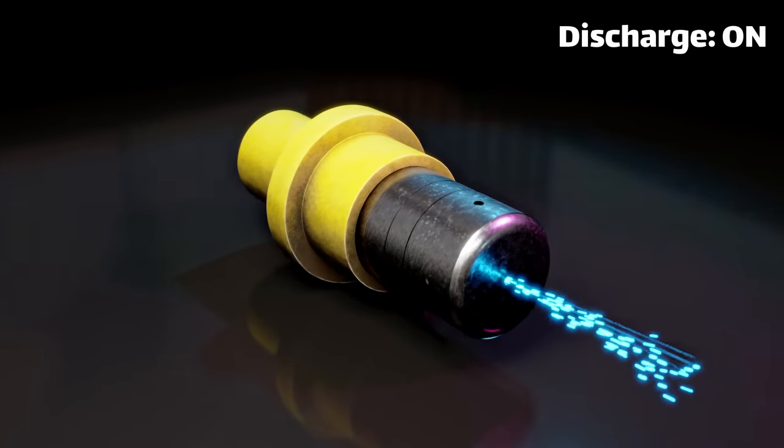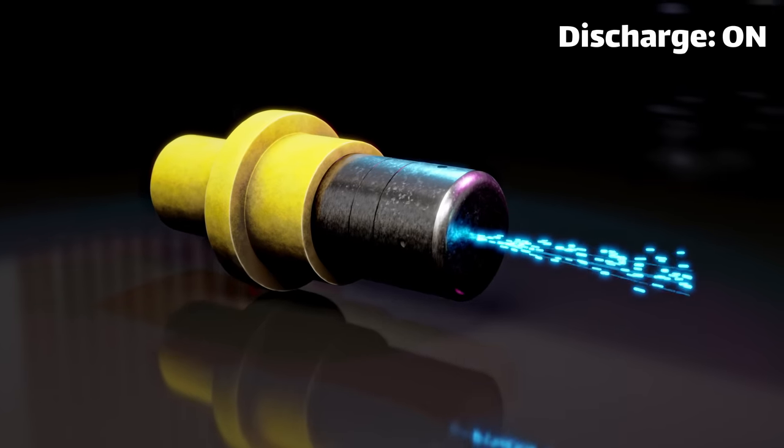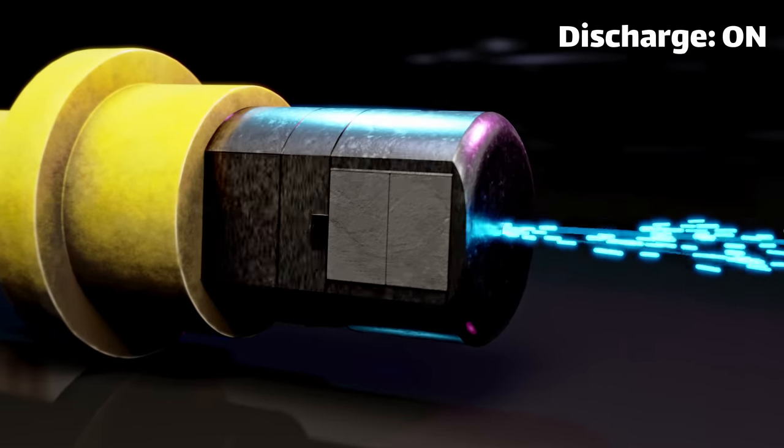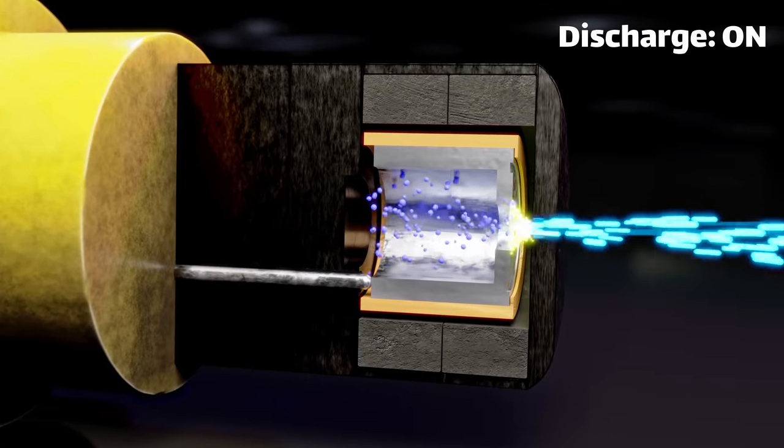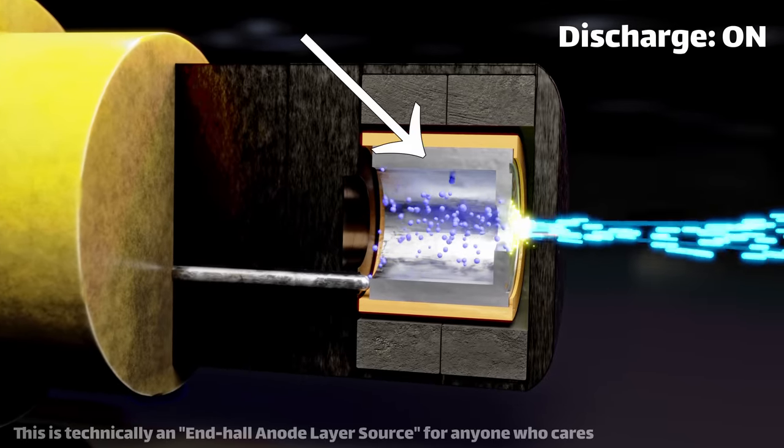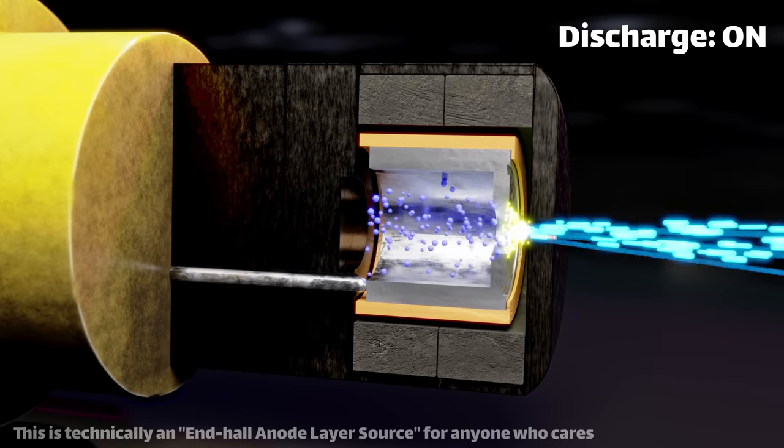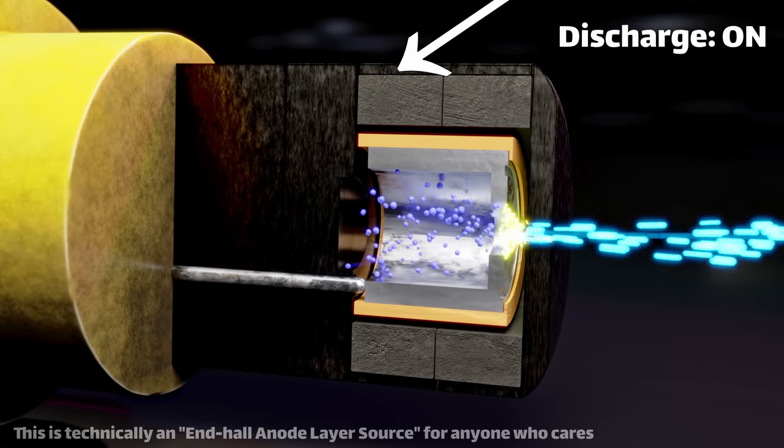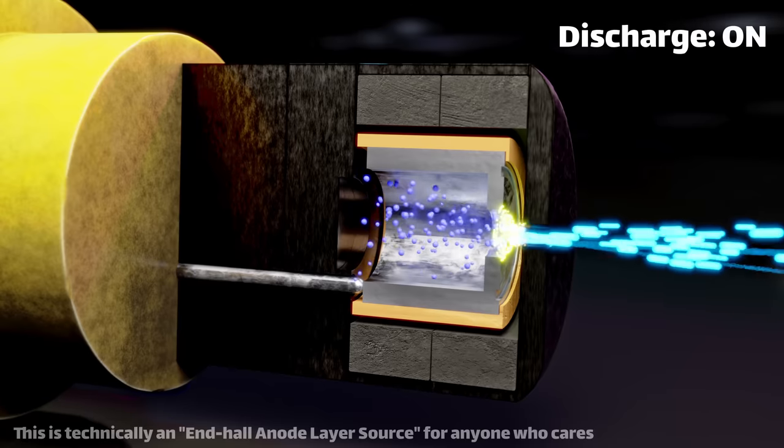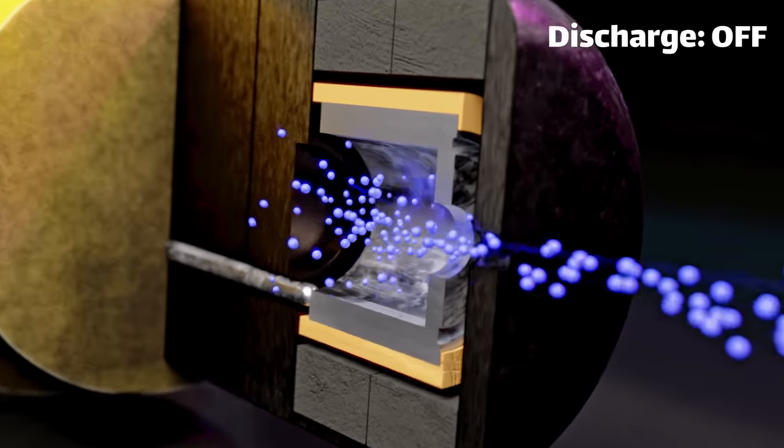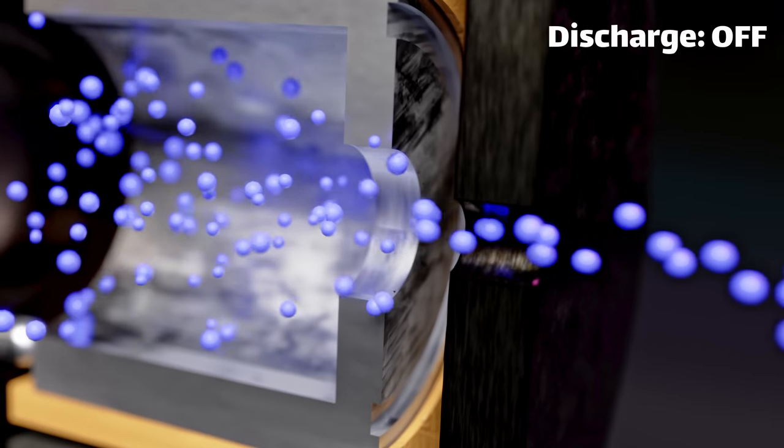An ion gun accelerates a beam of ionized particles at your target. Argon is typically used because it's inert and doesn't interact with your sample. Inside the gun there are only a few components. There's an anode surrounded by an insulator at the very center. This in turn is surrounded by some magnets. And finally there's a cathode which forms the outer shell. Argon is emitted into the chamber's interior and a high voltage potential is applied between the anode and the cathode.